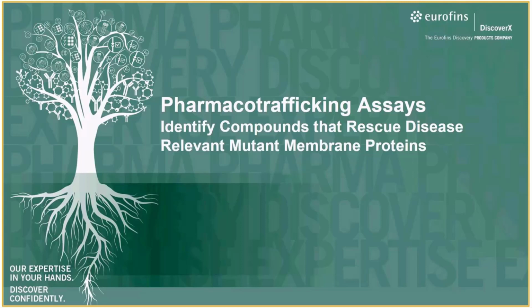What we'll go over is three different sections. First, I'll start out with going over what cellular protein trafficking is and trafficking defects, and then how they relate to diseases with the focus on drug therapeutics. Then these are specifically called pharmacological chaperones, and how these pharmacological chaperones potentially correct these diseases. And then we'll go over the assay technology and follow that up with several different applications for drug discovery as well as subunit assembly type of applications.